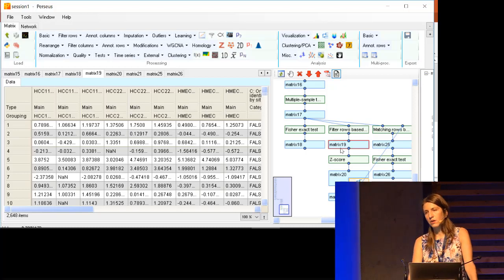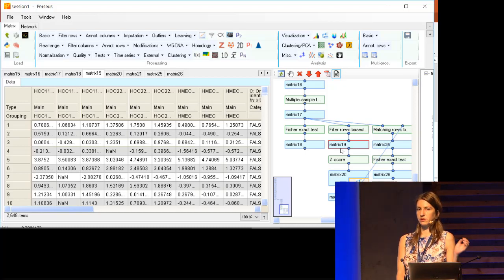And a downside of principal component analysis is that we cannot do it when we have missing values. You can still see that we have some NaNs here and there. So the first thing we have to do is get rid of the missing values. Of course, we could in other circumstances impute those and still go ahead.